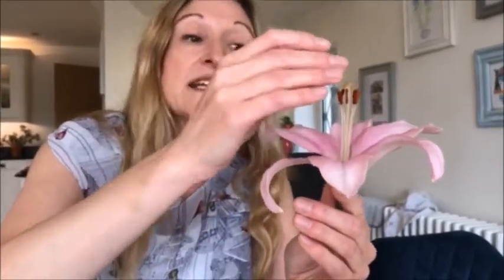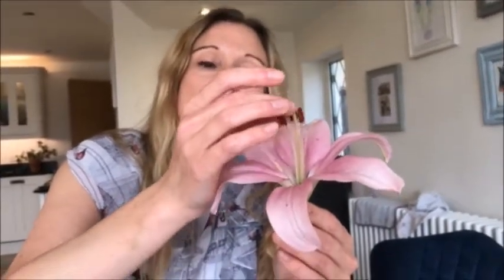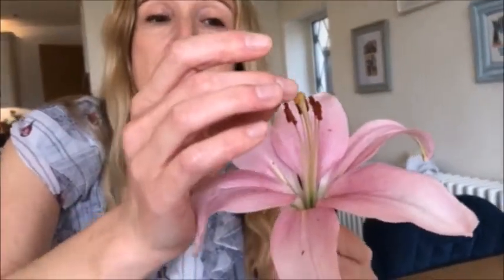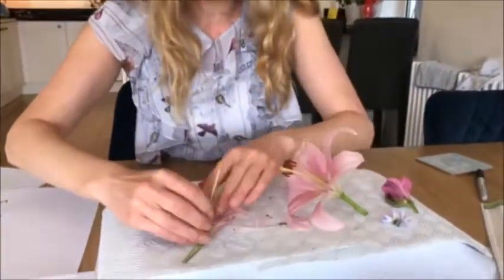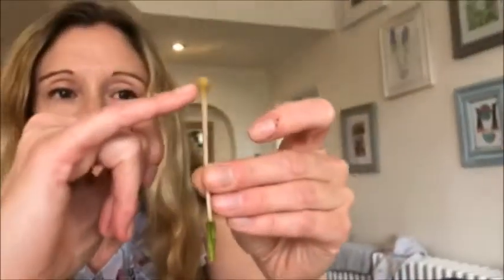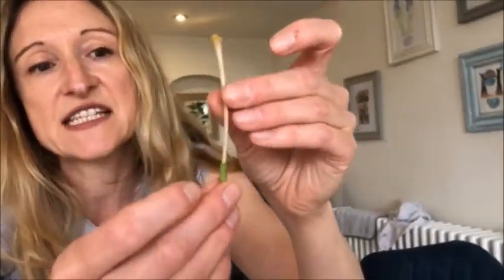on this structure here. Now, incidentally, what the bee is actually getting from the flower is honey from the nectaries, which are down here, which you might see in a minute. But the bee incidentally lands on this structure here, sticky, okay? And this is called the stigma. And the pollen then grows a long pollen tube down this structure here. If I swap over, you can see it's dissected out here. The pollen grows down this structure here, and this structure is called the style.